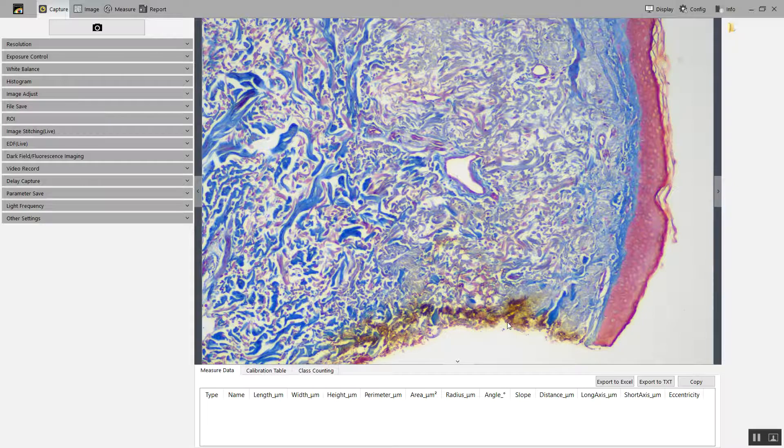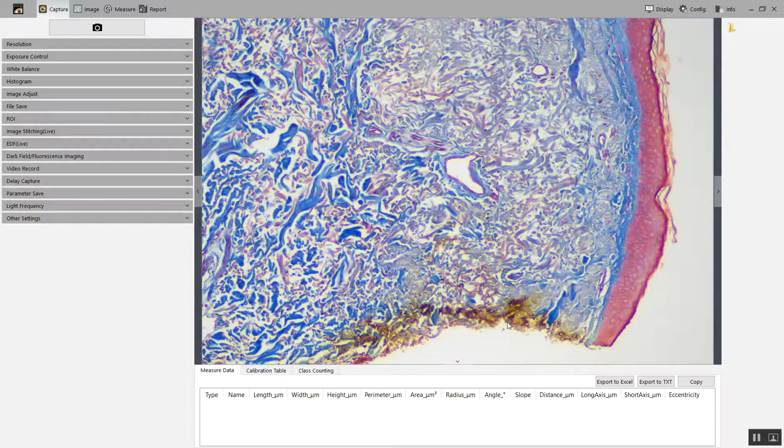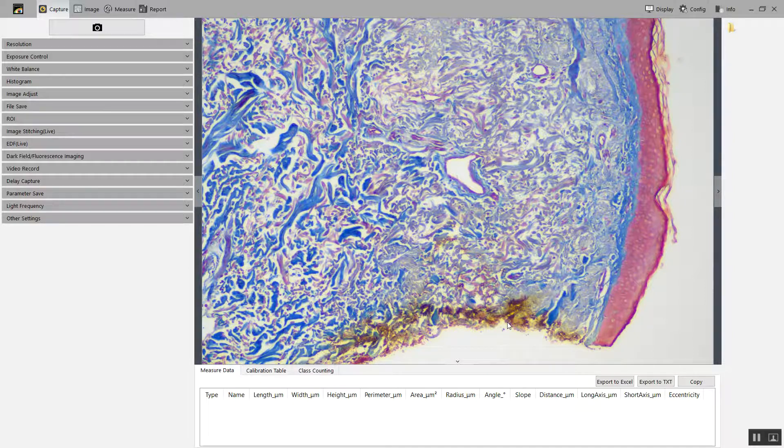Before you start your stitching experiment, be sure to use white balance and flat field correction to provide the best possible images.